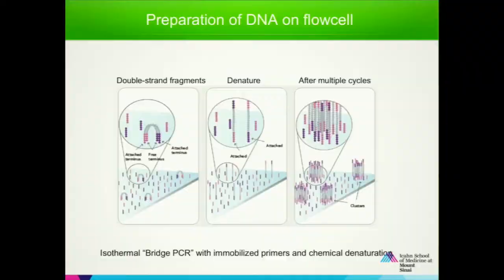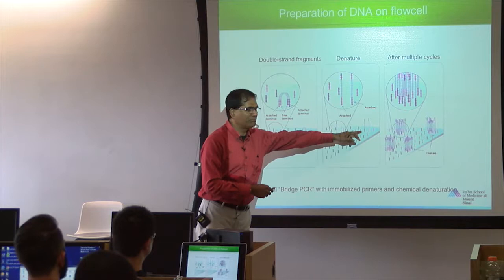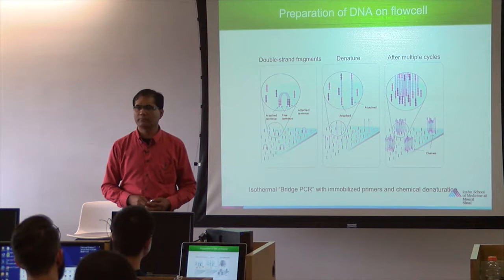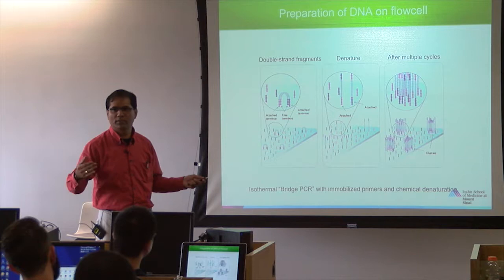But when we go into detail about this, to understand how this high throughput was developed, conceptually, it's a very beautiful concept that people developed. So let's spend some time on that. Same thing like beads. If you stick it to each one here, then when you get this fluorescence, it is too weak to detect. So if you could clone, that means we can clone each single strand. And when you clone this, you increase the signal, and like this, there are bunches. They're called clusters. If you know Illumina terminology, they'll say clusters.